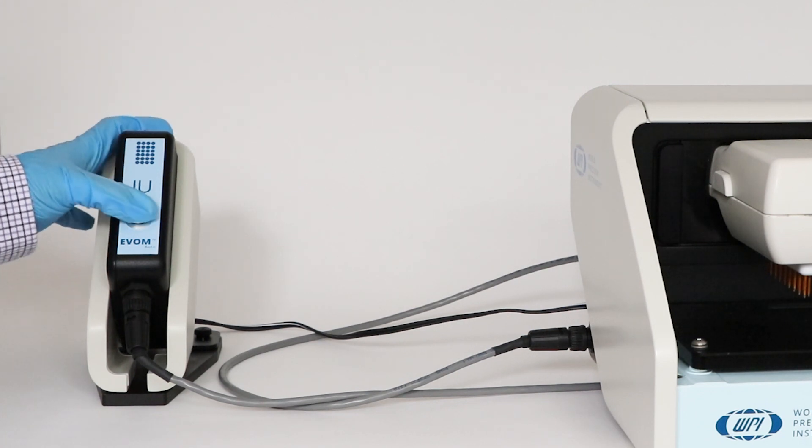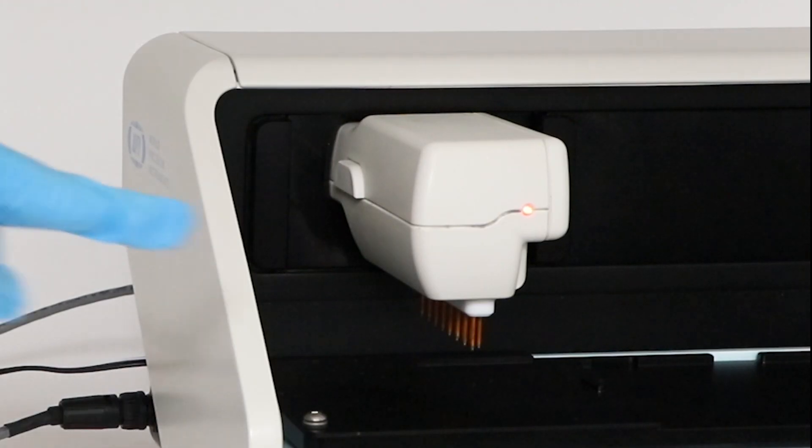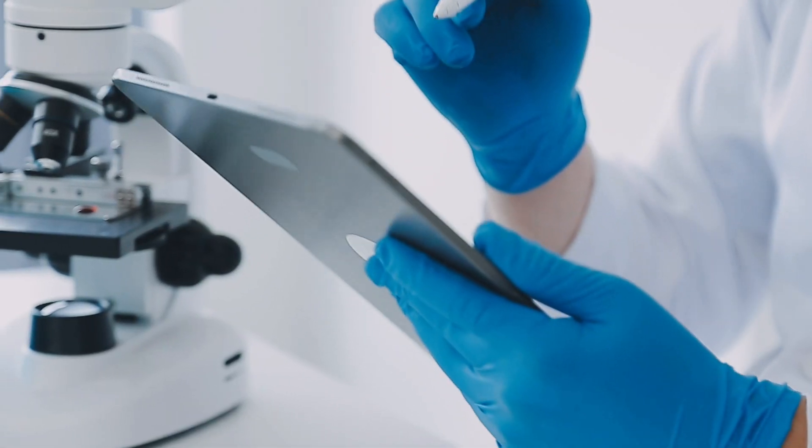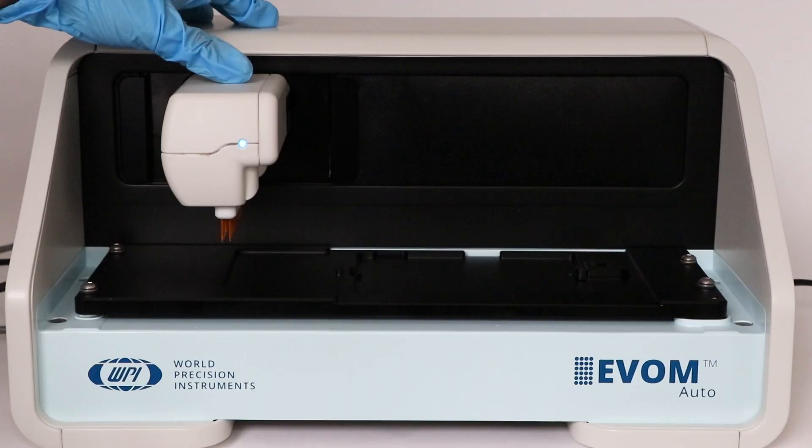Next, power on the interface unit. The light will be red on the electrode array when the interface unit is first powered on. After the communication is established between the software and the EVAM Auto system, this red light turns blue.